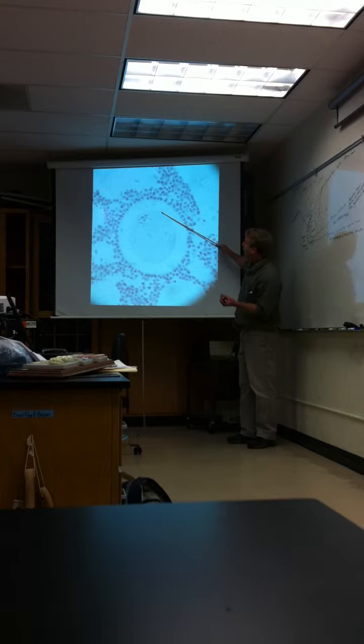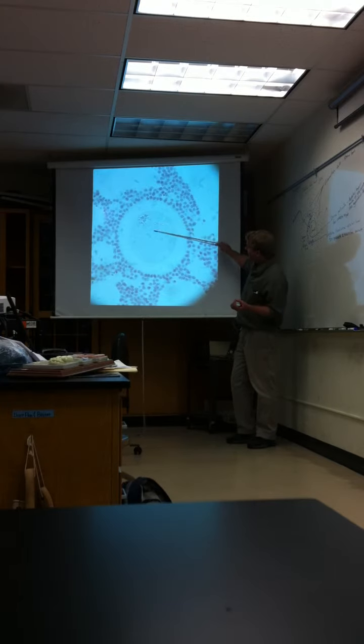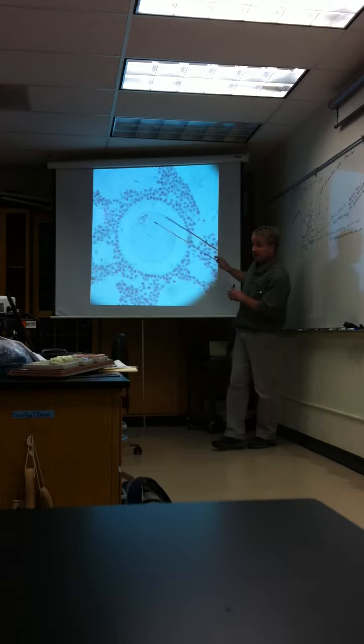And so I could also just point to the oocyte and say, identify the outer layer of the cell at the tip of the pointer. And that would be oolemma. You want to know that the oolemma is the plasma membrane of the oocyte. And so you can see it. You do see that, but it could just be asked by pointing to the oocyte.